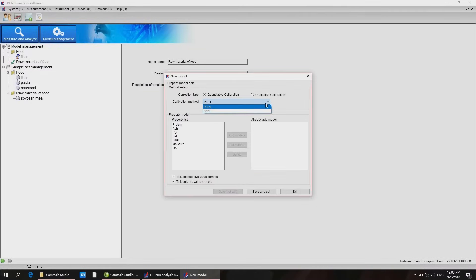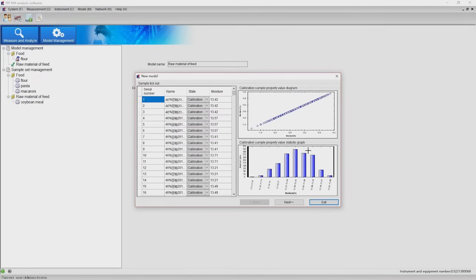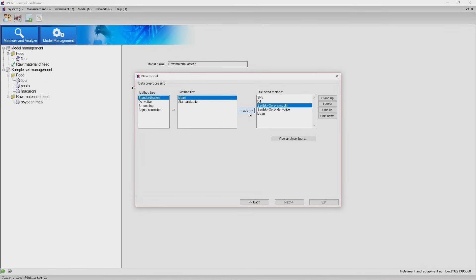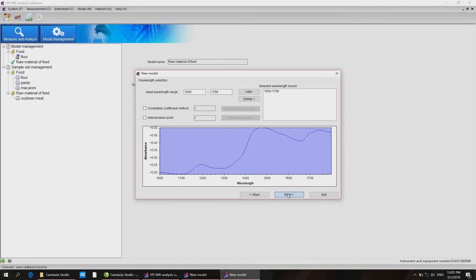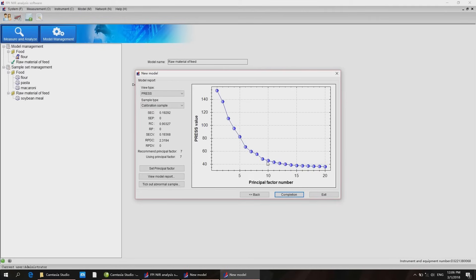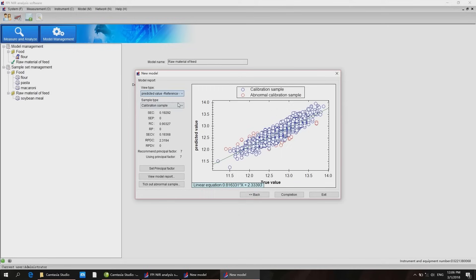Choose method PLS or ANN, select pretreatment method, and adjust the main parameters including press, predicted value versus chemistry value, property residual and so on according to certain rules.